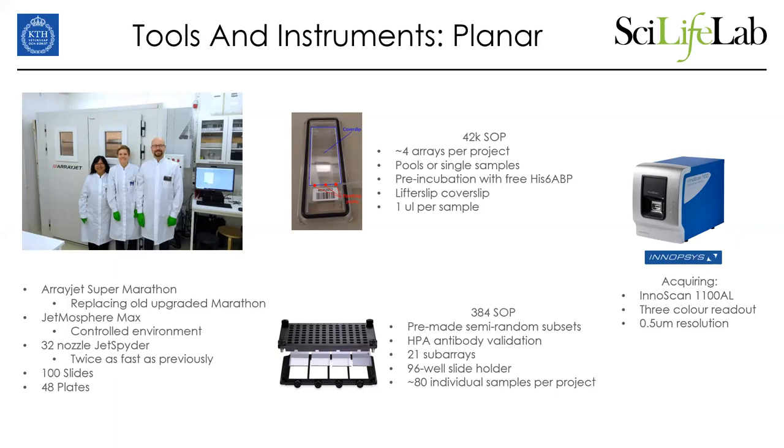With this new instrument, we ordered a 32 nozzle JetSpyder, and the old version that we had was a 12 nozzle JetSpyder. So we hope that this will be at least twice as fast as previously. We haven't had time to do extensive testing on that, but considering the fact that it takes up 2.5 times or so more samples per uptake, it should be quite a much less time necessary for all the washing. It fits 100 slides and 48 plates per loading.